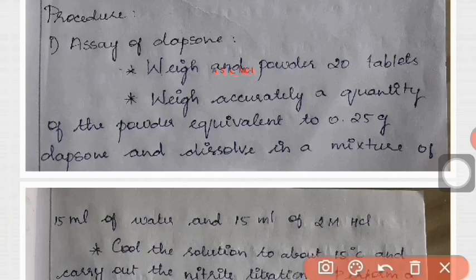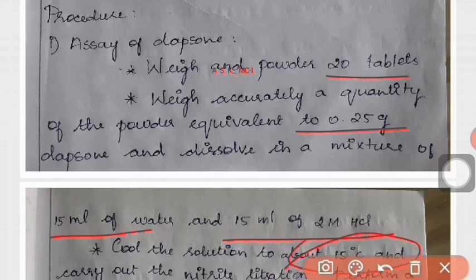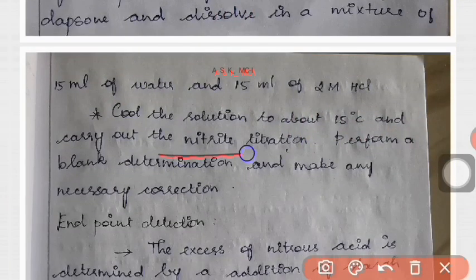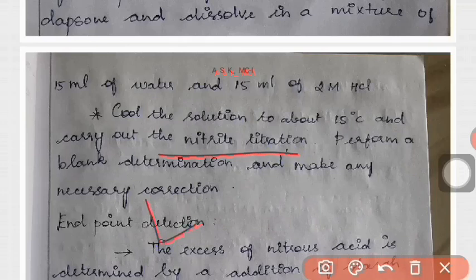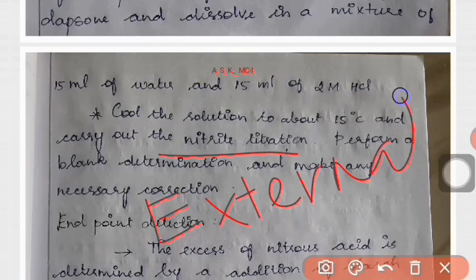Assay of dapsone is like this: powder 20 tablets, weigh 0.25 gram, add in water and HCl. Then cool the solution to 10 degree centigrade and titrate against sodium nitrite solution. The end point determination is by external indicator method.